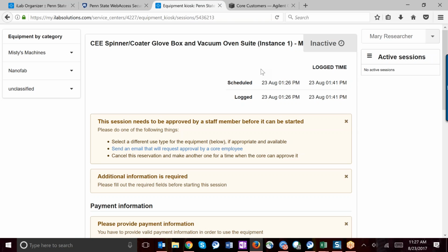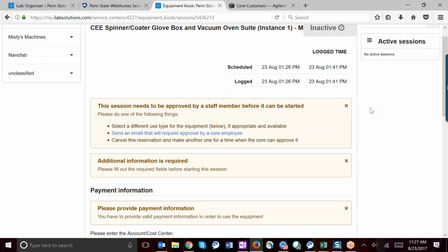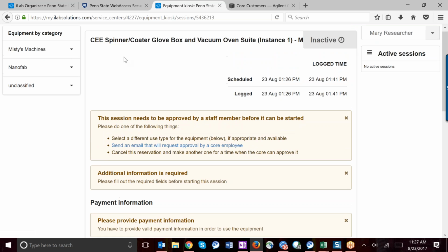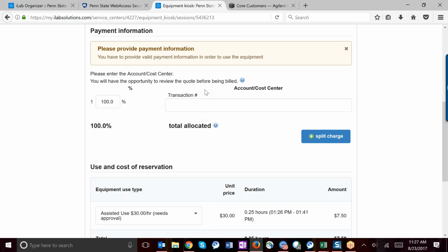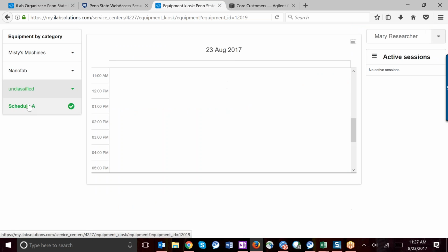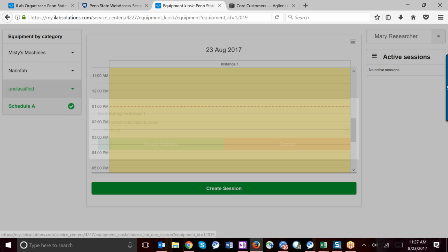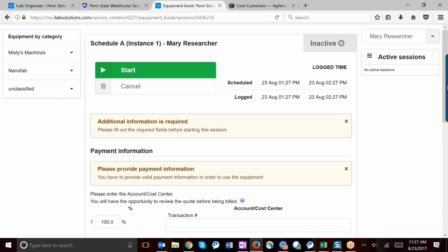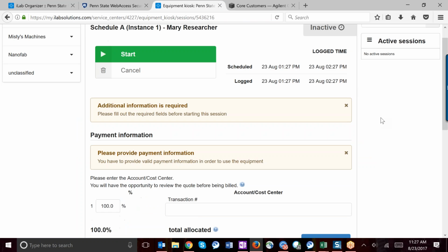So I have a couple things here. I've got the scheduled time. This one does need approval. Let me see if this Schedule A requires approval. I apologize, guys. Let's try this one instead, because I'd really like to show you the full process. There we go, perfect. So this one doesn't need approval. I'm doing a walk-up on this Schedule A. I can see there is a start button. I'm not going to get to that quite yet.